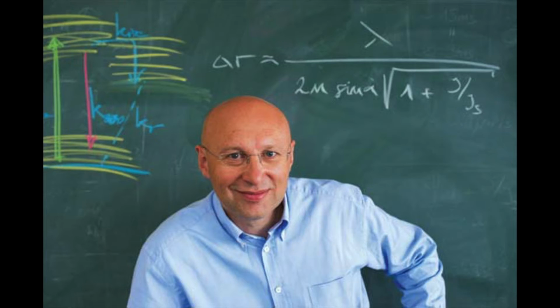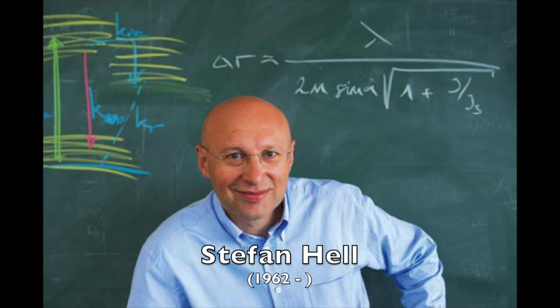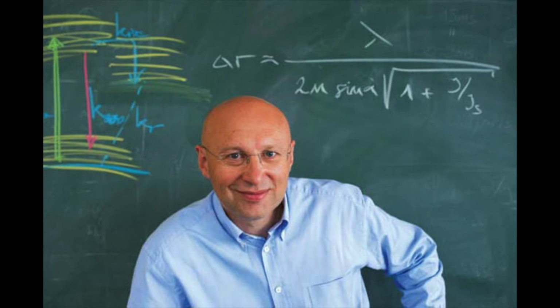As we move into the 21st century, the motivation that drove scientists centuries ago to improve resolution persists today. A recent example of increasing the resolution of the fluorescence microscope was demonstrated by Romanian-born German chemist Stefan Hell in a technique called stimulated emission depletion, or STED. In this method, the excitation wavelength is set to 635 nanometers, and fluorescence occurs between 650 to 690 nanometers.